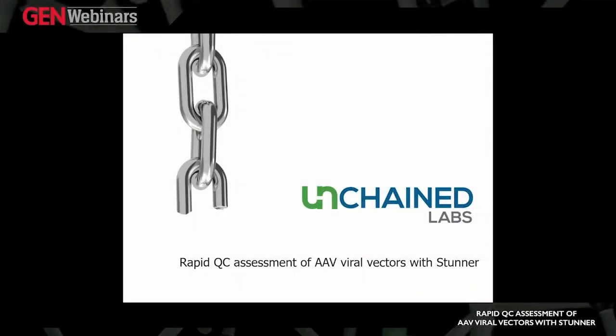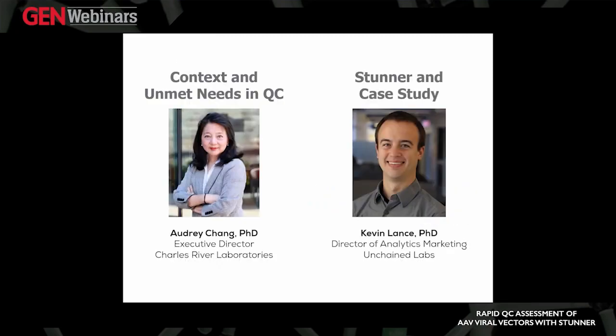Thank you for that introduction. And thanks for attending our talk on rapid QC assessment of AAV viral vectors with Stunner. Today, Audrey and I will both be discussing different elements of AAV QC. Audrey will be introducing adeno-associated virus and giving a taste for the current state of QC testing and characterization, and go into the current unmet needs for analytical tools in a manufacturing environment.